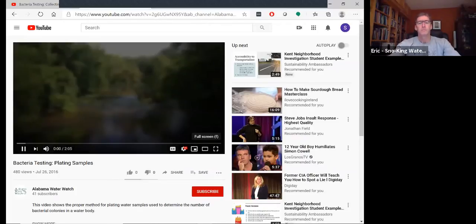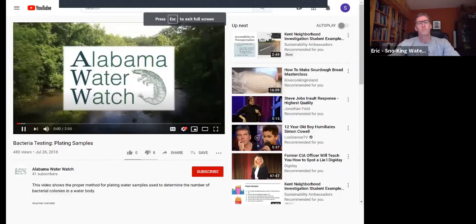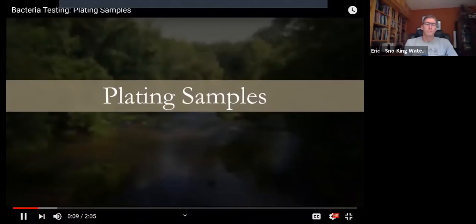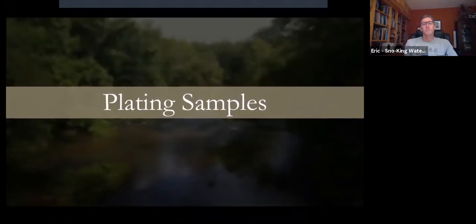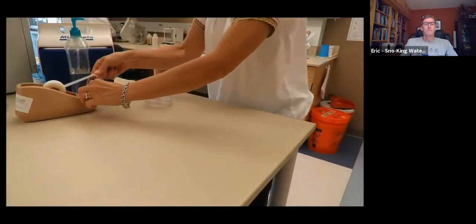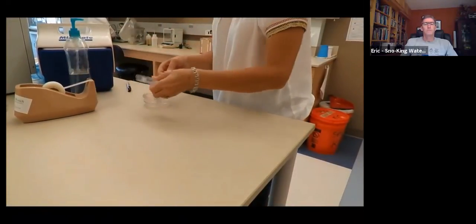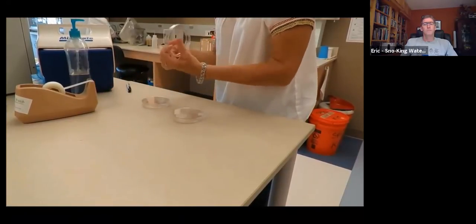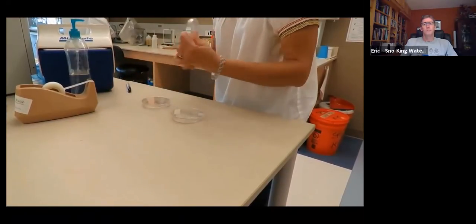Welcome to the Alabama Water Watch instructional video series. This video will show the proper method for plating water samples used to determine the number of bacterial colonies in a water body. This is the second step in a 3-step process. The first and third steps, collecting the samples and determining results, are covered in their own separate videos. Prepare your petri dishes by taping the top, the larger piece, to the bottom, the smaller piece, on one side of the dish. Keep the dish closed as much as possible to avoid contamination.